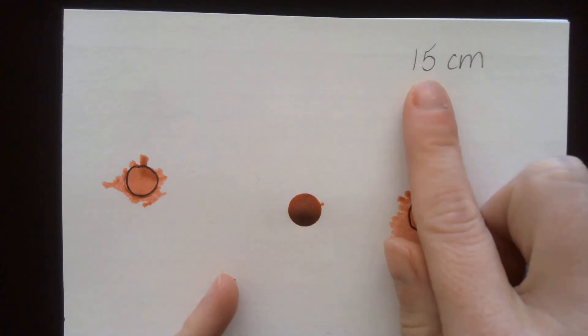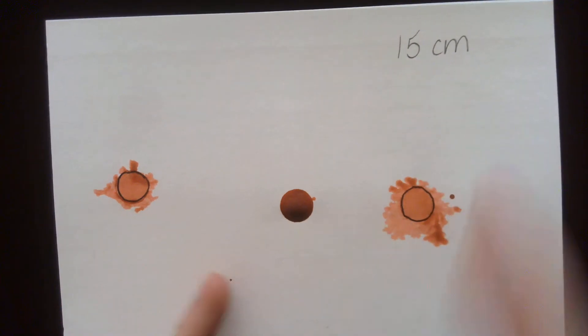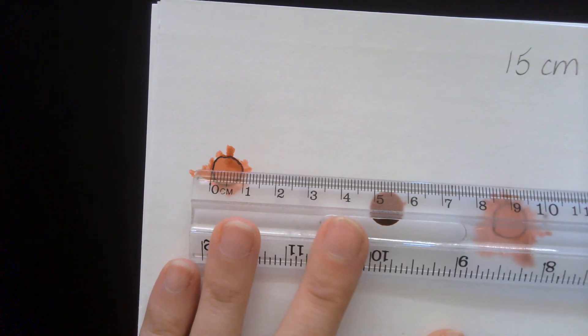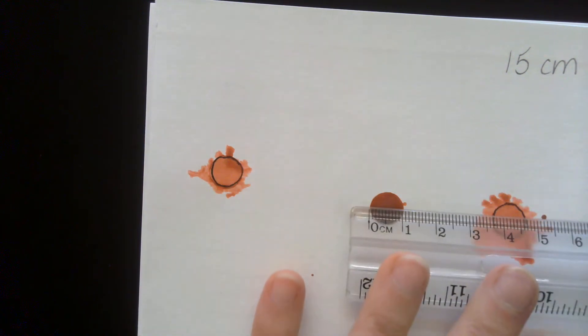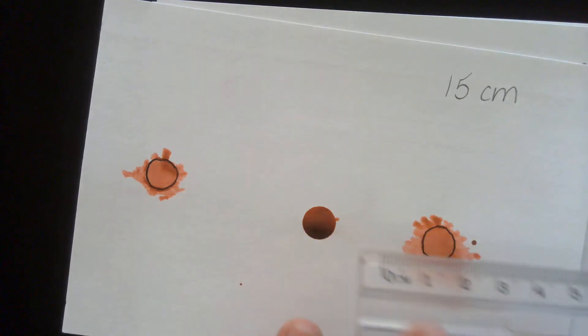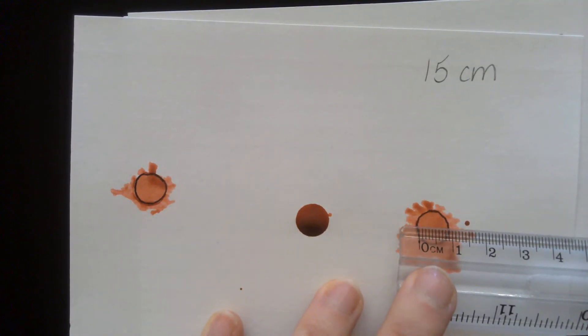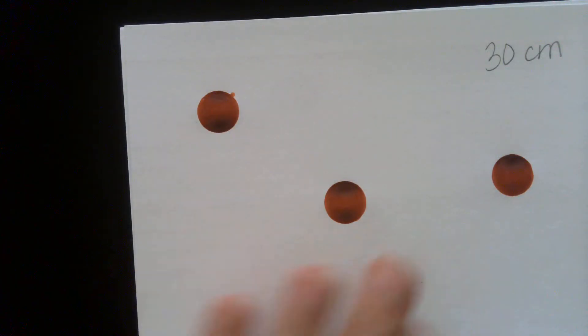You're going to measure the diameter of each blood drop. These are the samples from 15 centimeters. I'm going to line up the ruler — you can go ahead and take the measurement. You're measuring in millimeters, so use the smallest lines on the ruler. You can pause the video in between each one if you need to.